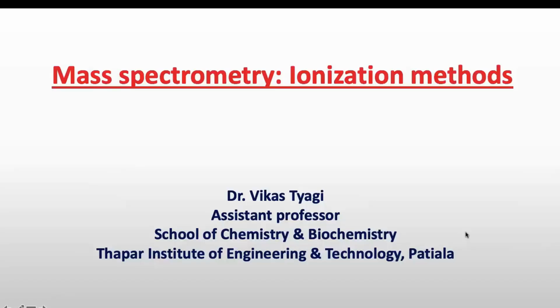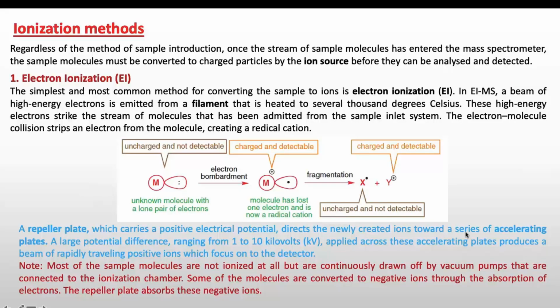Hello everyone. In this video I am going to discuss the ionization method we use in mass spectrometry. In our previous lecture I discussed the first component of mass spectrometry, the sample inlet, which converts our sample to vapor phase, because we are injecting the sample as a liquid or solid and the sample inlet converts that to vapor. And then, as you know, we cannot control neutral molecules, so we have to convert them to ions. That's why we convert the sample into ions first before analyzing its mass. So let's see what methods we use for ionization.